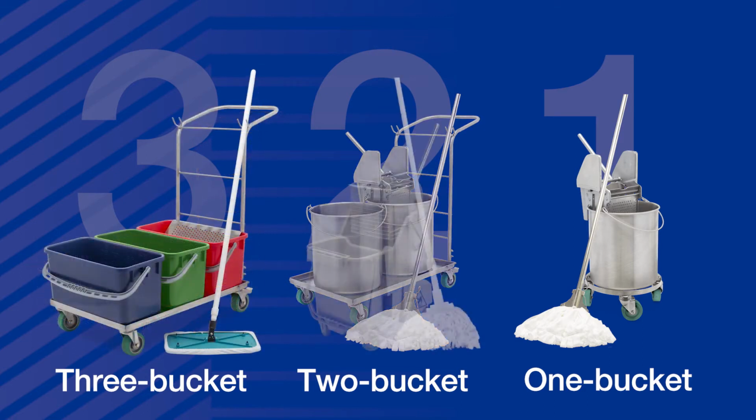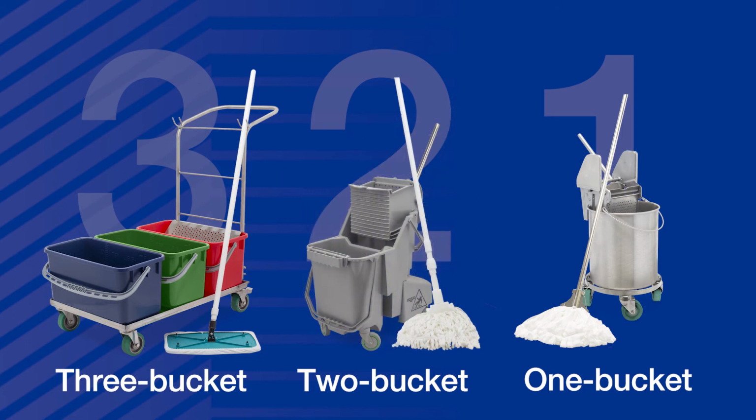The choice of a bucket system depends upon the type of clean room and process, critical or less critical, cleaning philosophy, task being performed, and/or space constraints.